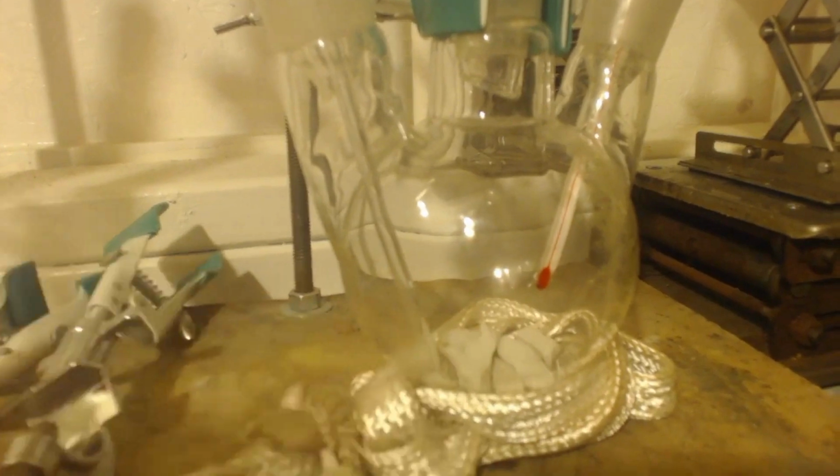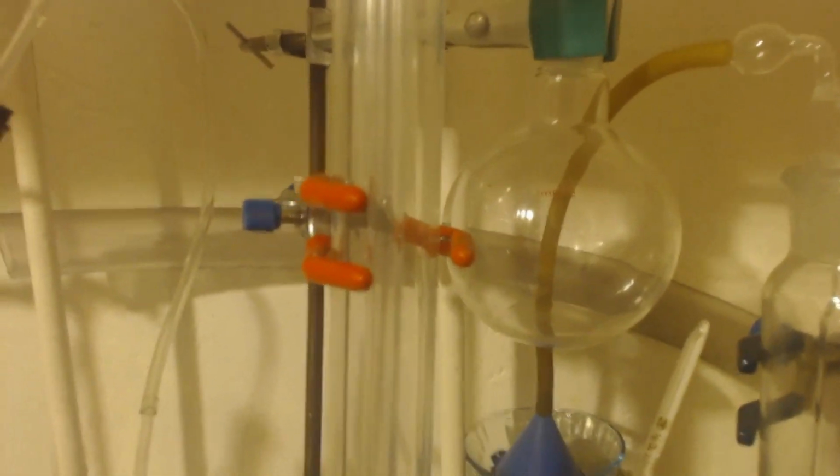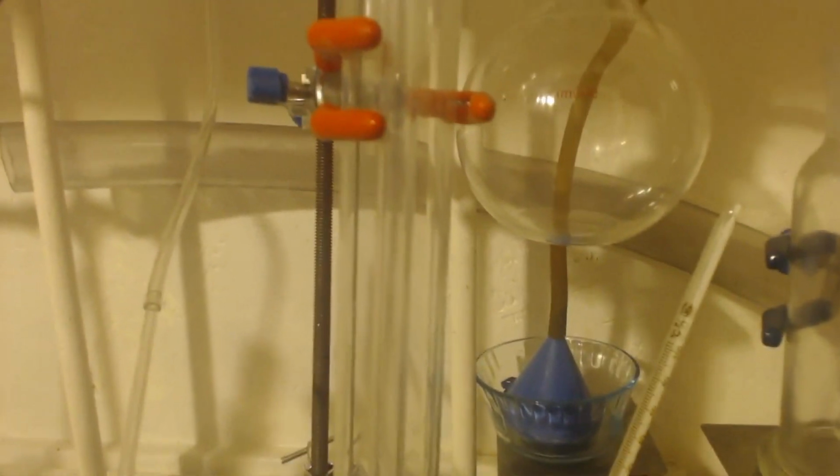Now it's going to make HCl. The HCl goes up. You see at the top of the condenser, I got a hose going down here to another suckback trap. That's all this is. It's just an empty bottle. I might put some sodium hydroxide in there, even though there's nothing being bubbled in there, you know what I mean? But the gas that's stuck in there will react, and it'll absorb some of the HCl. But mainly it'll come up here to this hose, around to here, to this.